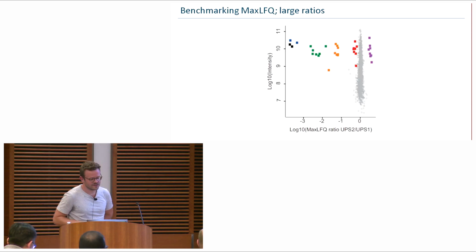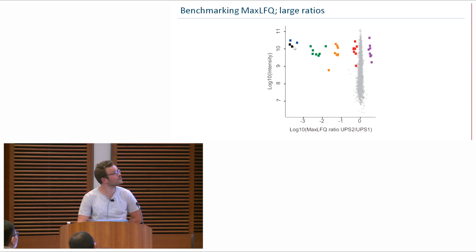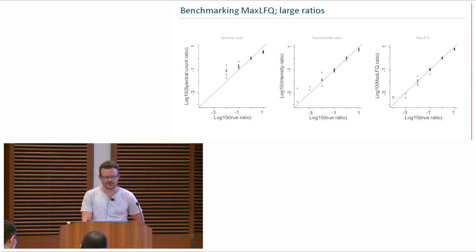On this plot, you can see these clusters of 8 proteins each, and you can see how the MaxLFQ is able to quantify very, very small or large ratios, however you calculate it. Okay.